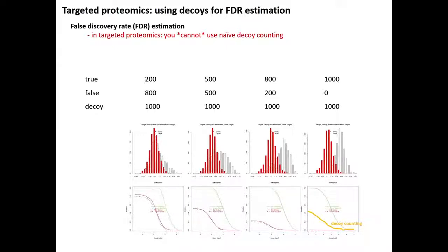So we tried different models when we wrote the open source paper as well. We are revising each time a little bit differently. I mentioned the pseudo-reverse, we went to shuffle, and we came back to pseudo-reverse plus pseudo-changing of amino acids. The point is that you want to avoid super high scoring decoys.